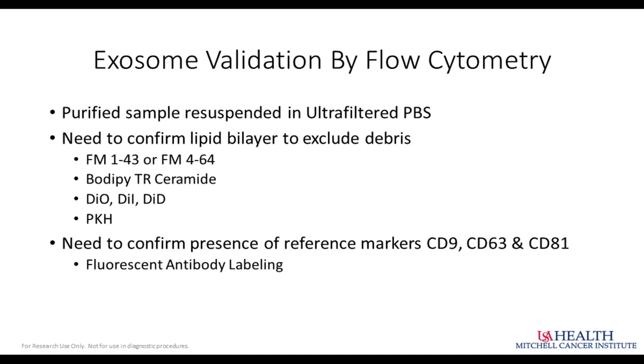The Bodipy is actually only available in one color. It uses 561 excitation and emits light in the range of 575 to about 625. We have not really tried this with or without washing. It may be possible to use that one as well without washing, but we have not validated that.